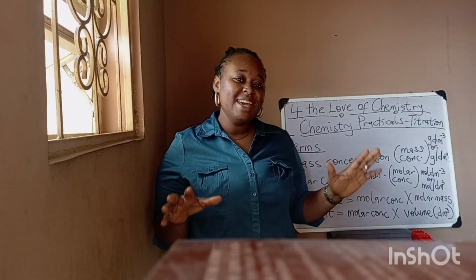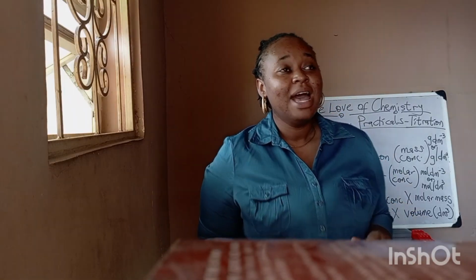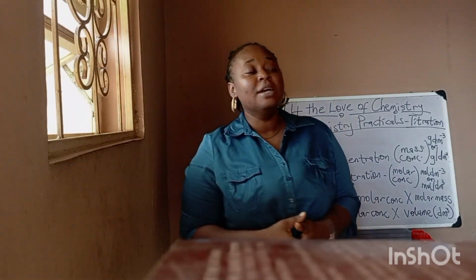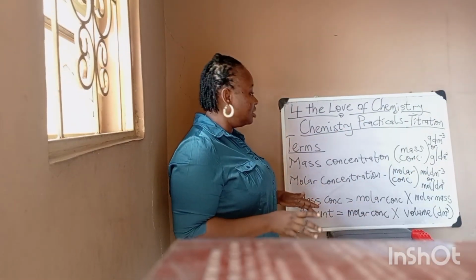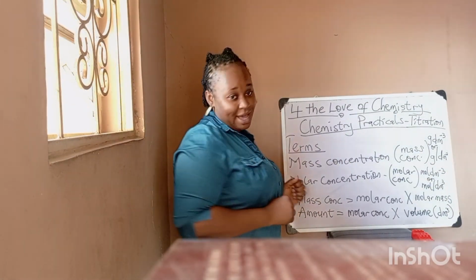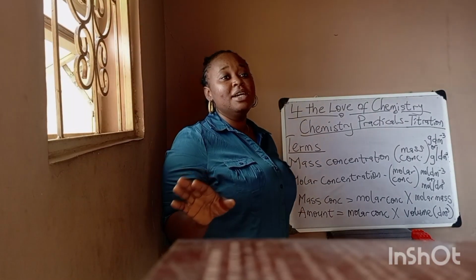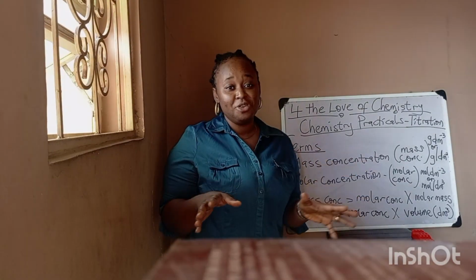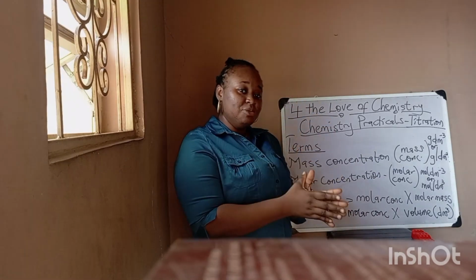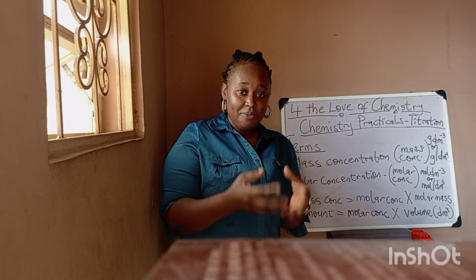So here are my own nuggets concerning your practicals. I want to start with titration because that's the first one. Today, as you can see on the board, we are introducing titrations. So today, I'm not into explaining your theory. You can read that up for yourself. My area of concentration is the things that we need in calculating our practicals.